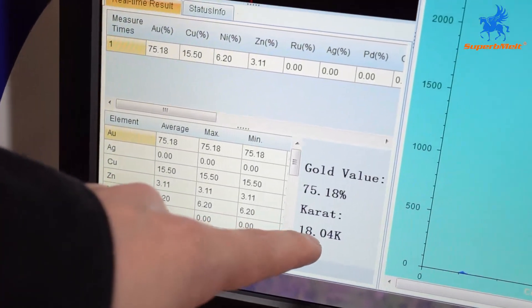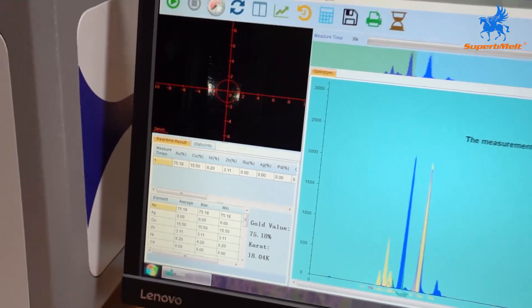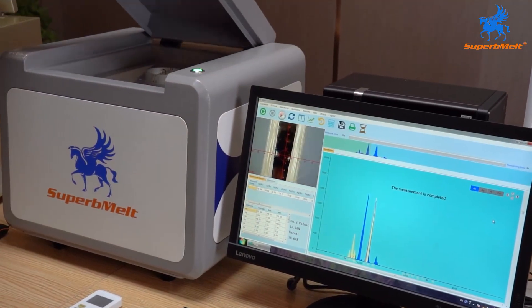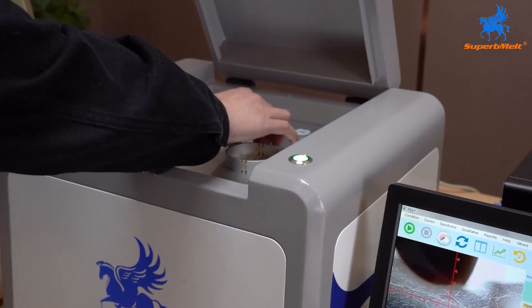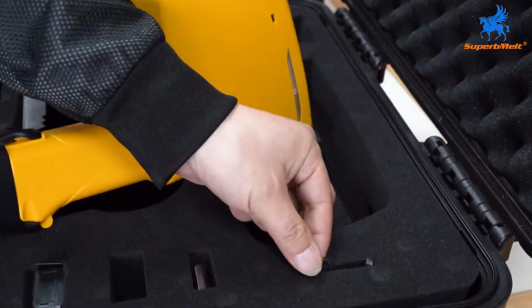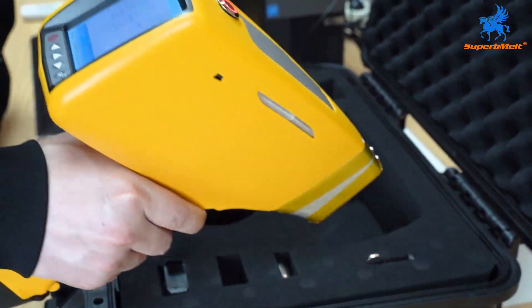Now we will use the handheld XRF analyzer to test the same ring.